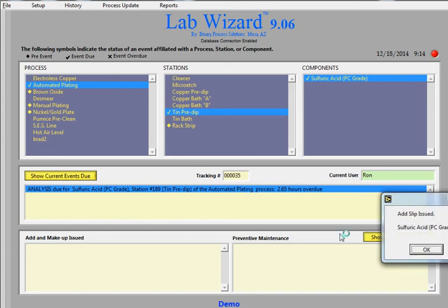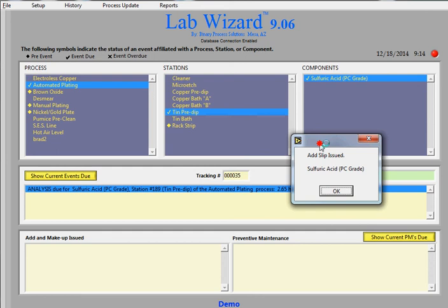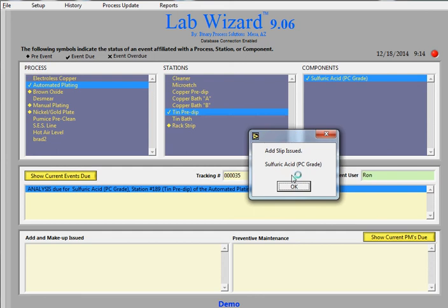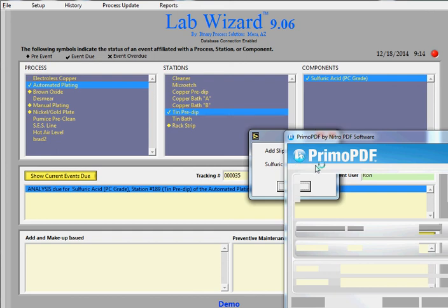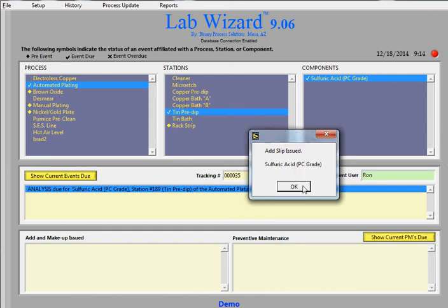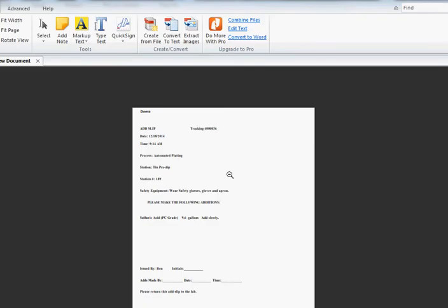And it automatically issued an add slip. So the printer now has this add slip. And here's the printout right here showing the add slip. So the technician would take this paper, perform the add, and then put it into the stack of wherever the management wants them to put the completed add events.